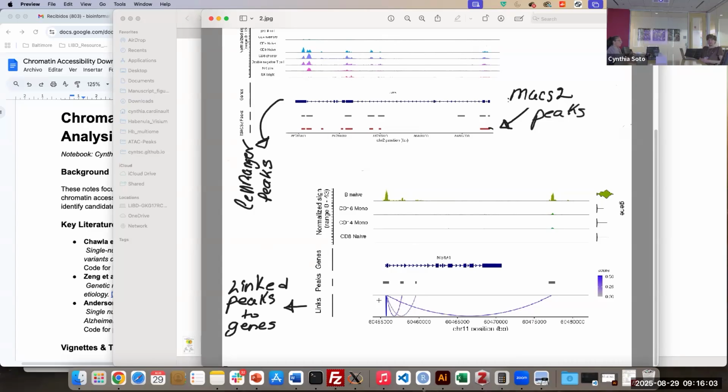Other information that we have is that these links, or correlations, between different genes and peaks are also evaluated, attributed and scored, so we can know the strength of the relation. That way we can establish whether we have co-accessibility regions at different distances, or what is the strongest relationship that we have. And whether these relationships are related with promoters, enhancers, or silencers, depending on the analysis.